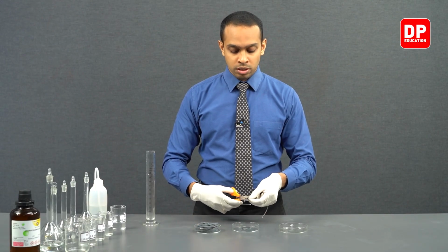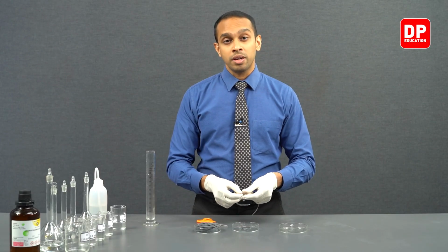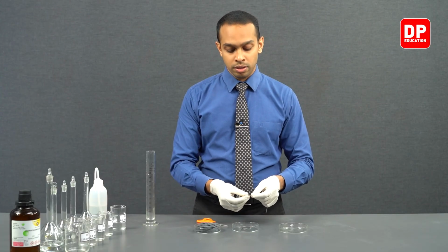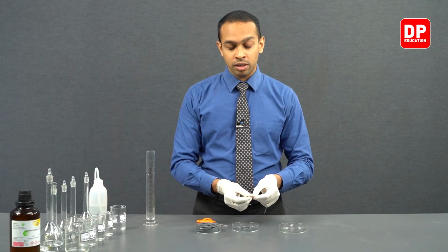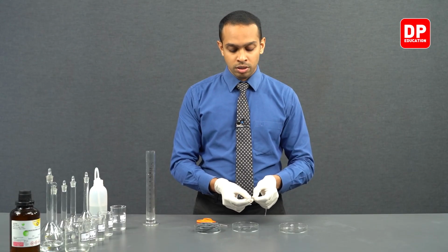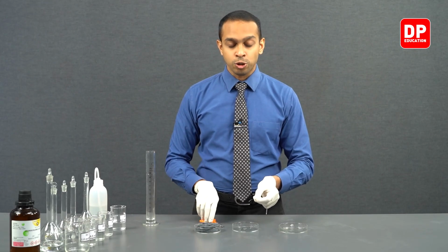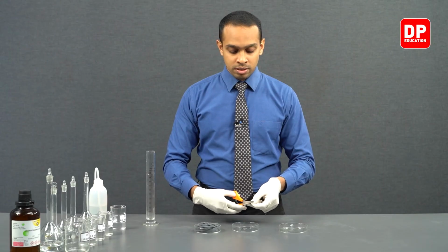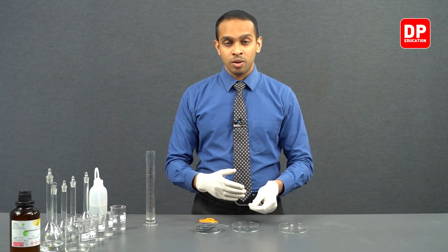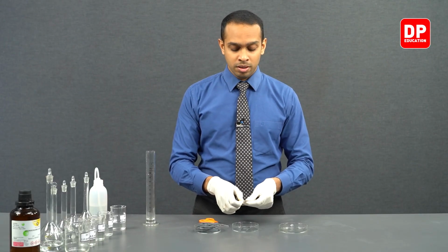As you know, surface area affects the rate of the reaction. So if you have a magnesium strip that is longer, much longer than the others, then it would have a larger surface area, which would increase the rate of the reaction. So to eliminate this factor playing a role in this reaction, we make sure that we use magnesium pieces that have the same surface area.